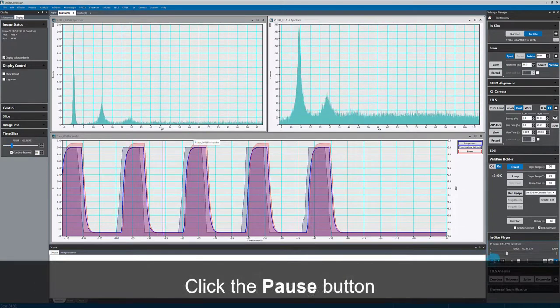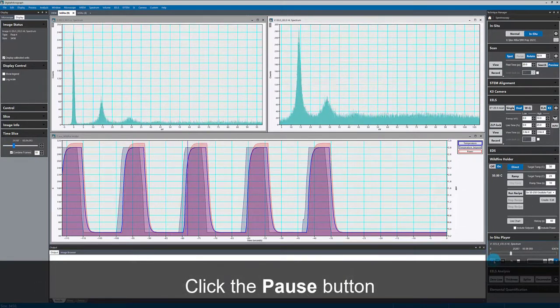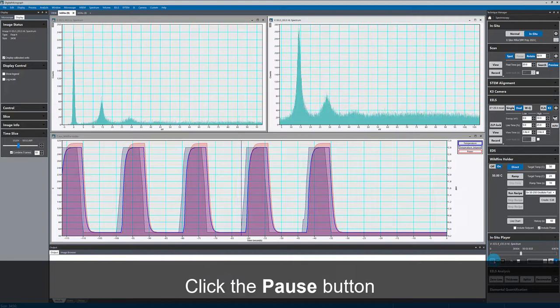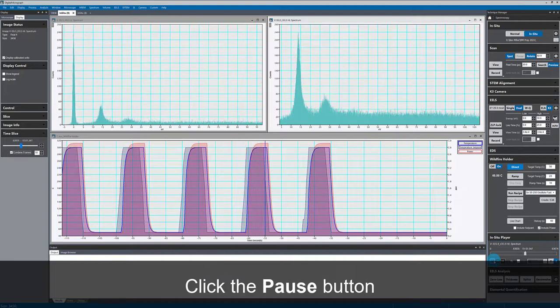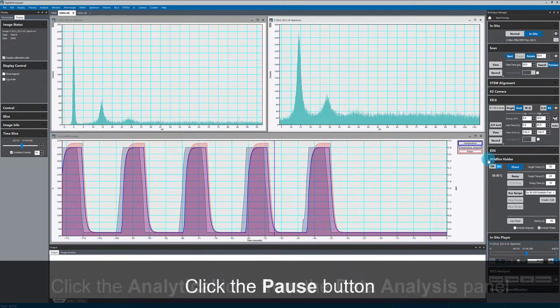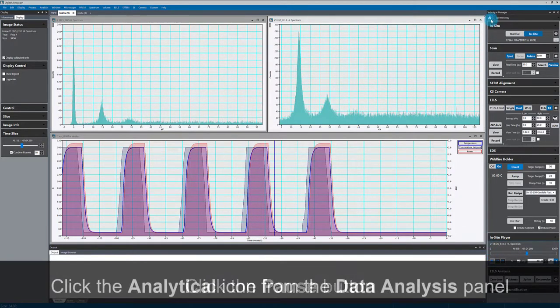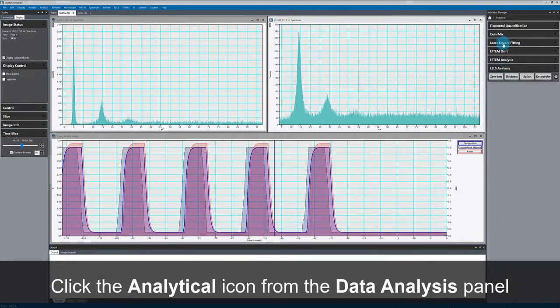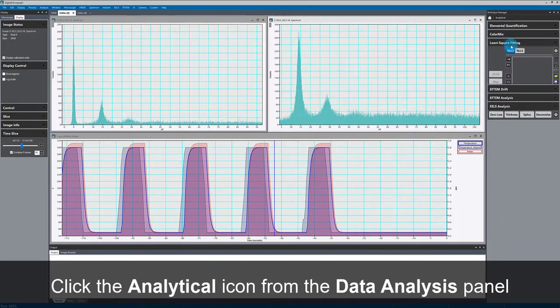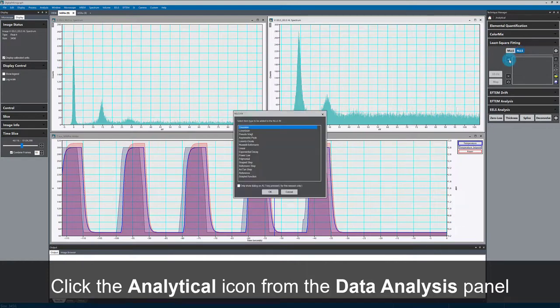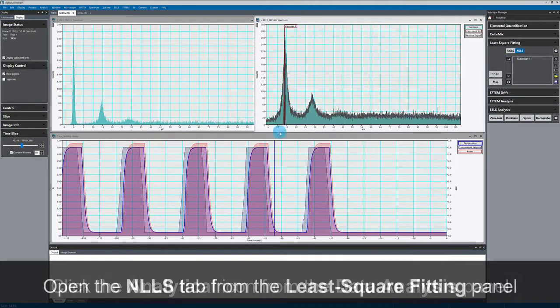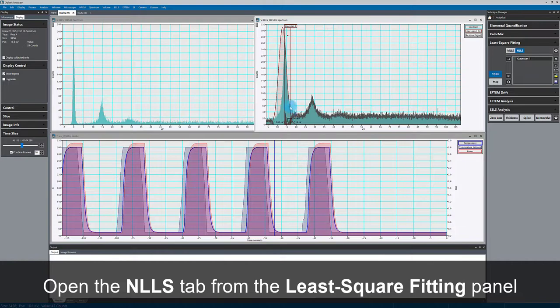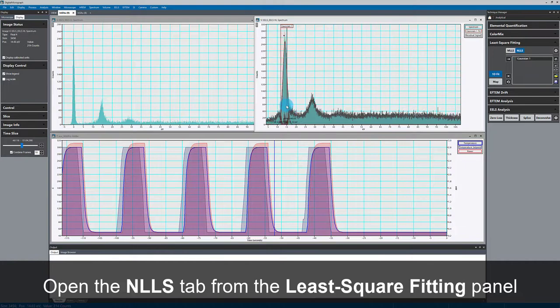And again, all of this is synchronized as it plays back. Now, I'll fit my EELS data using Gatan's tool for nonlinear least squares fitting, and I'll fit this plasmon peak with a Gaussian function.